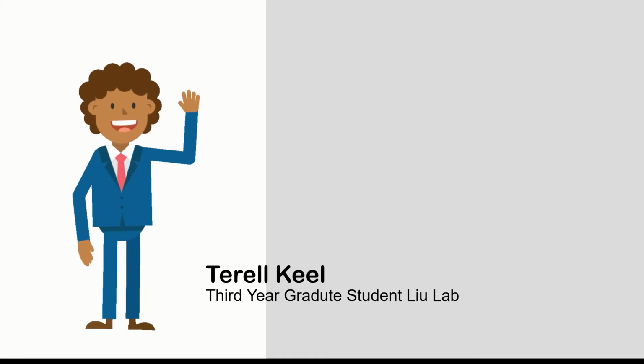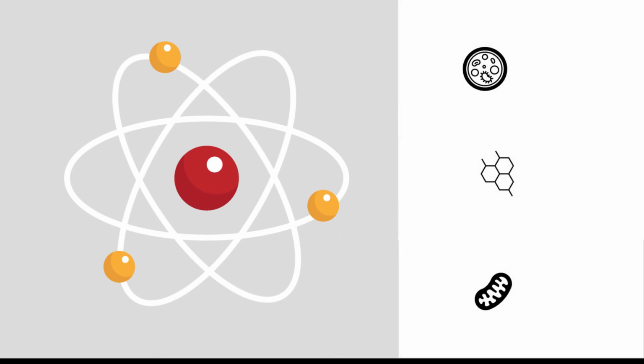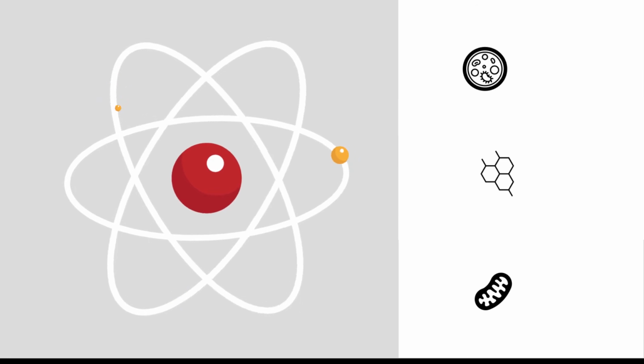My name is Terell Keel, and I'm a third-year graduate student in the Liu Lab, and I'll be your guide and narrator in this virtual lab tour. Our focus is the application and development of nanotechnology. This deals with the design, engineering of nanostructures, bioreceptors, biosensors, and reaction sites precisely positioned on a surface. So this means single cells, proteins, molecules, and atoms.